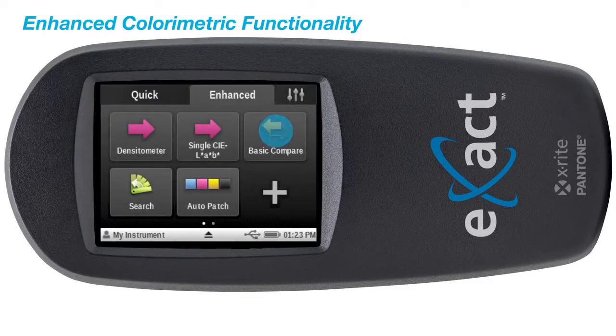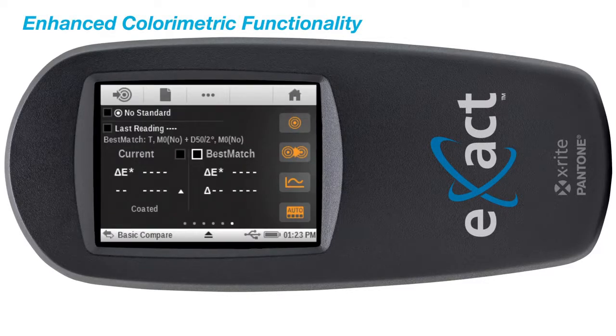It also includes the best match function, which will provide guidance for you to achieve the best color match quickly and efficiently.